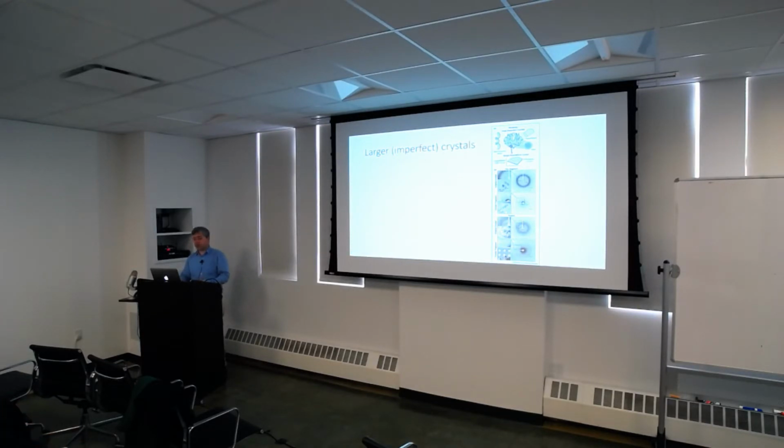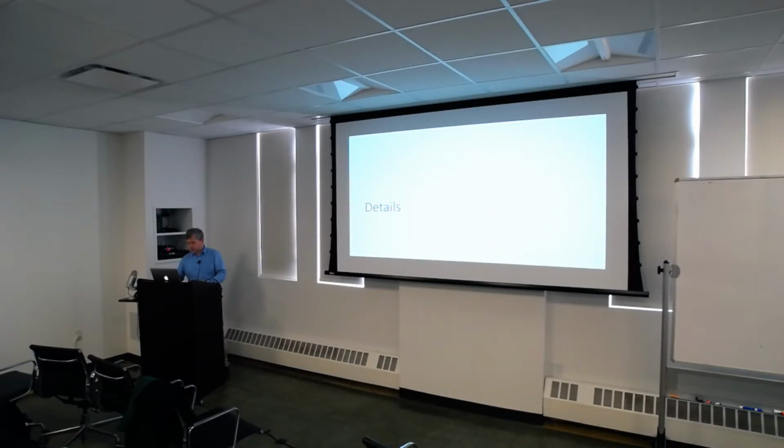After breaking it up, they may well be almost invisible. So you are stuck at the screening stage, putting it on a grid to see if you've actually made them small enough that you get crystals on it. So, some more details about the workflow.